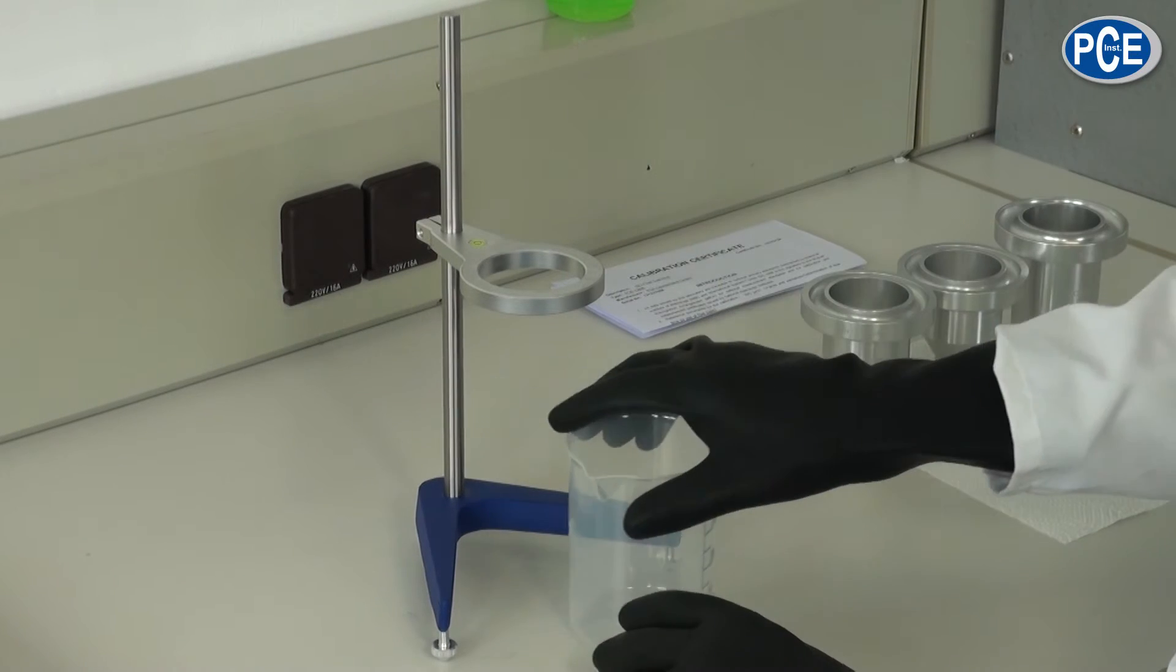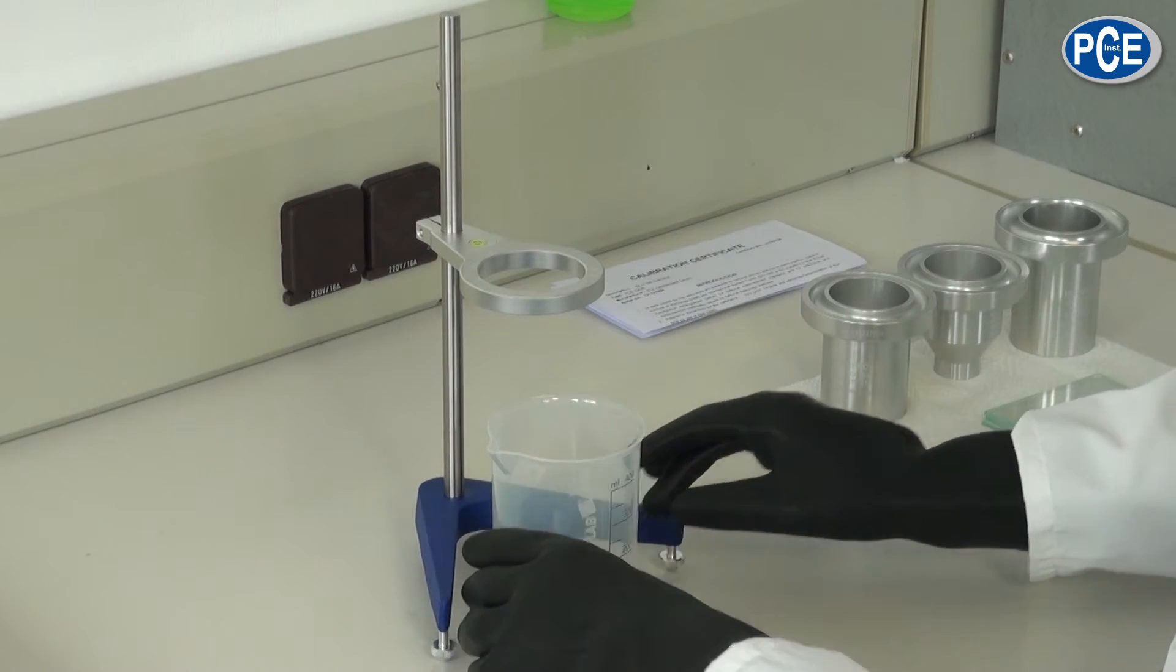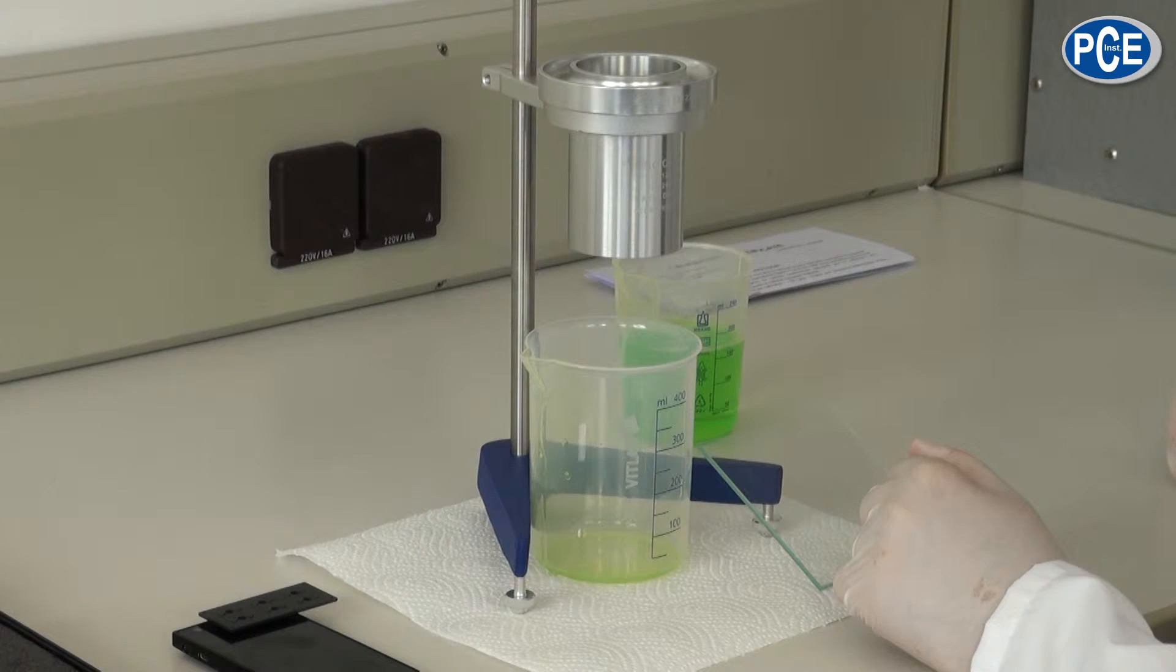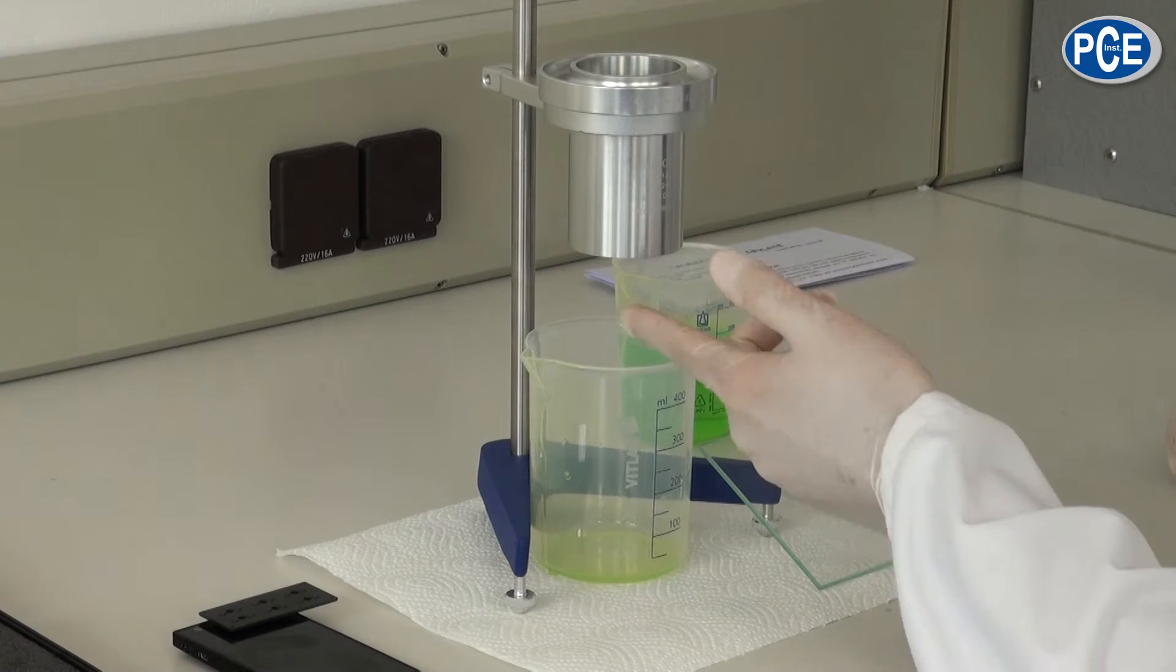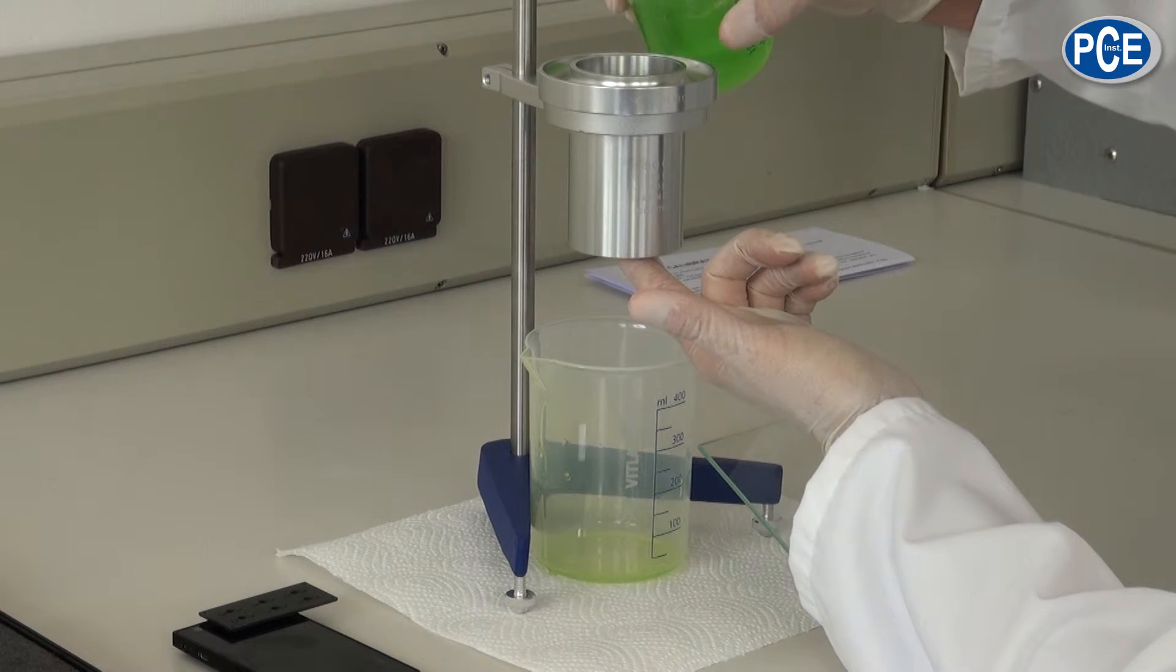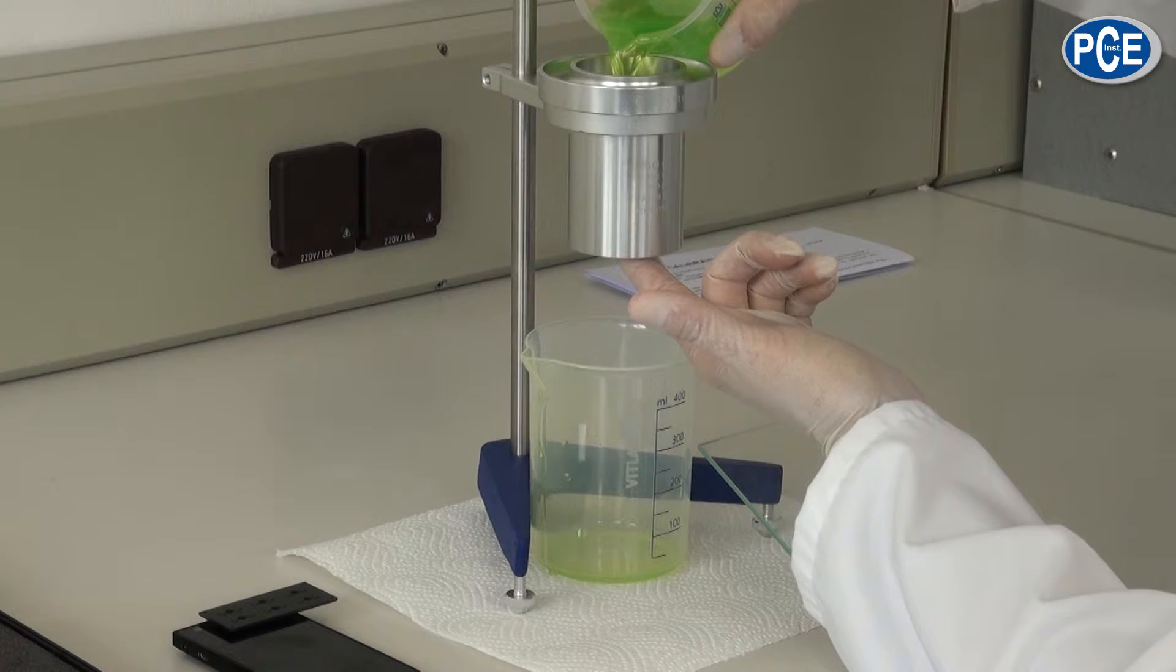To do a measurement you must go as follows. First of all, the overflow cup is placed into the stand holder. The outlet nozzle is closed with one finger, and the fluid to be examined is put bubble free into the cup.